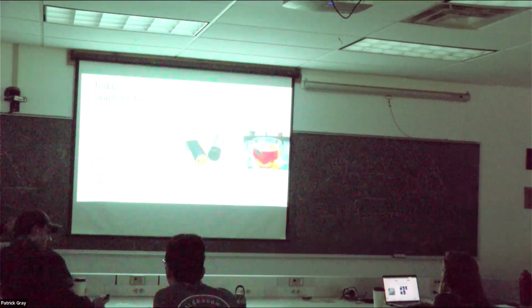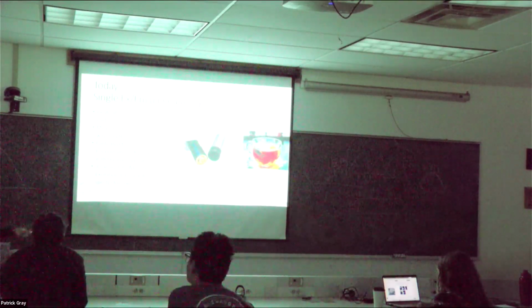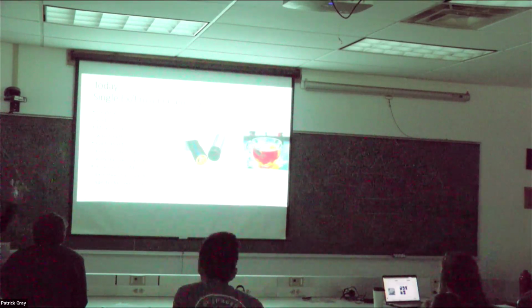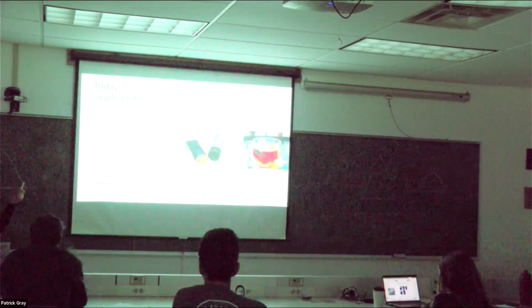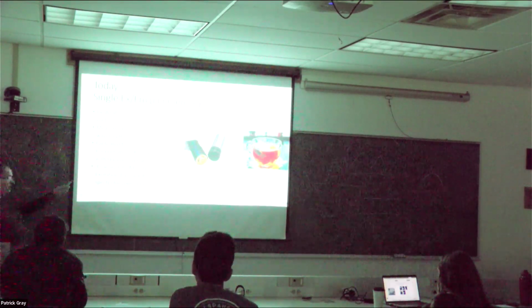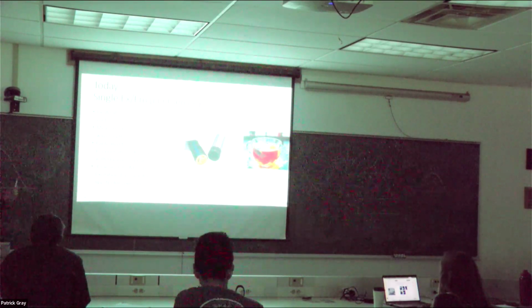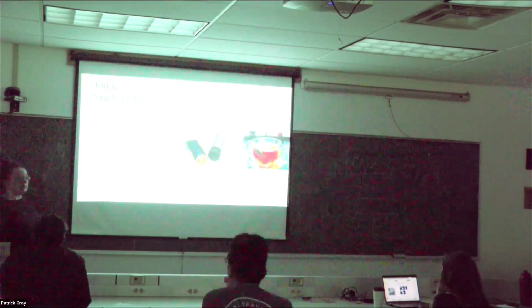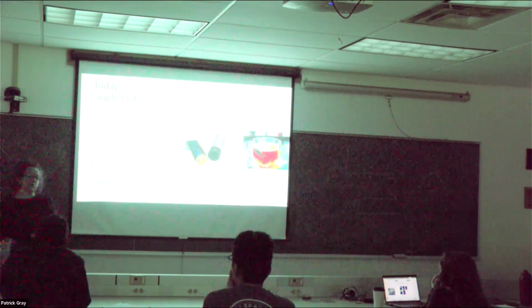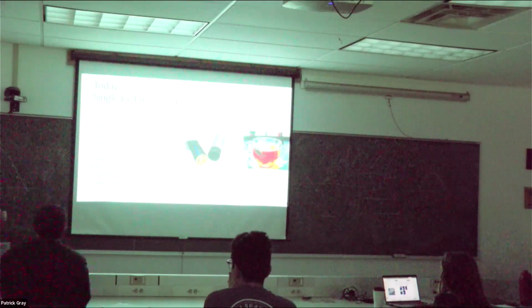I know, because it's a little bit different concept. You guys are not going to be doing that. Meg is going to be doing that. You're going to have a single wavelength excitation emission spectra, where you're going to be looking at the CDOM fluorescence in your riverine water, aka tea, and you will be looking at how that is changing in your DRE sample and your two culture samples, well, actually, one type of culture sample under two different light conditions.